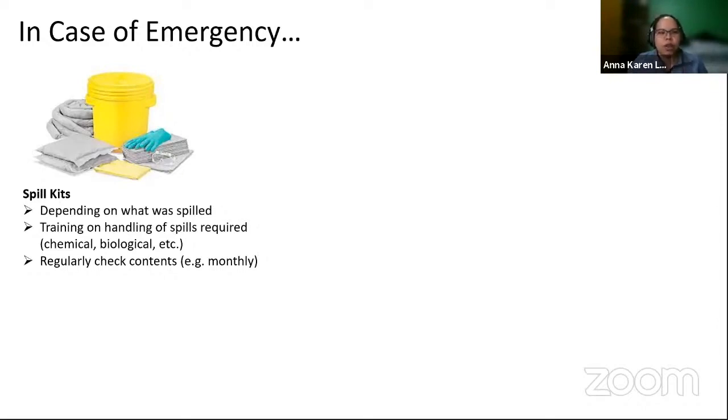And also in some cases you can make use of some tablets. There are tablets that you just put in one bucket of water, and then that will be used for the disinfection of your spill. So there are available kits for that.